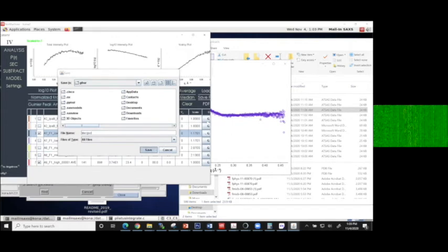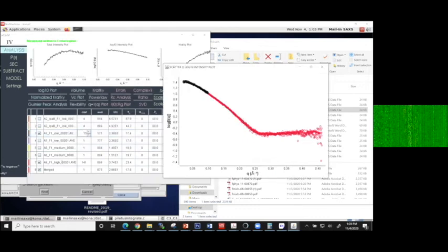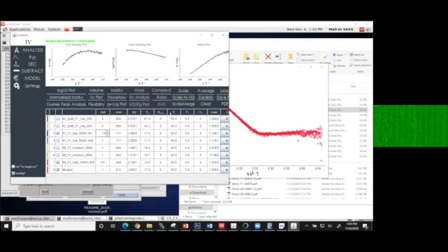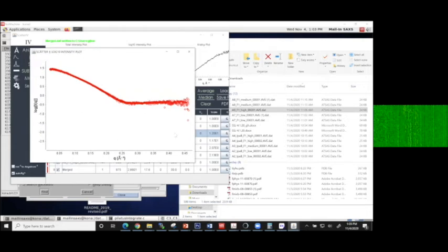All right, and then you have a scattering profile in your set here called the merge. This is the red curve, and it's a combination. I'm going to turn all the other graphs off. It's a combination of your zero concentration corrected sample and your high signal to noise and the high Q, because the concentration dependence typically only affects the Guinier region.